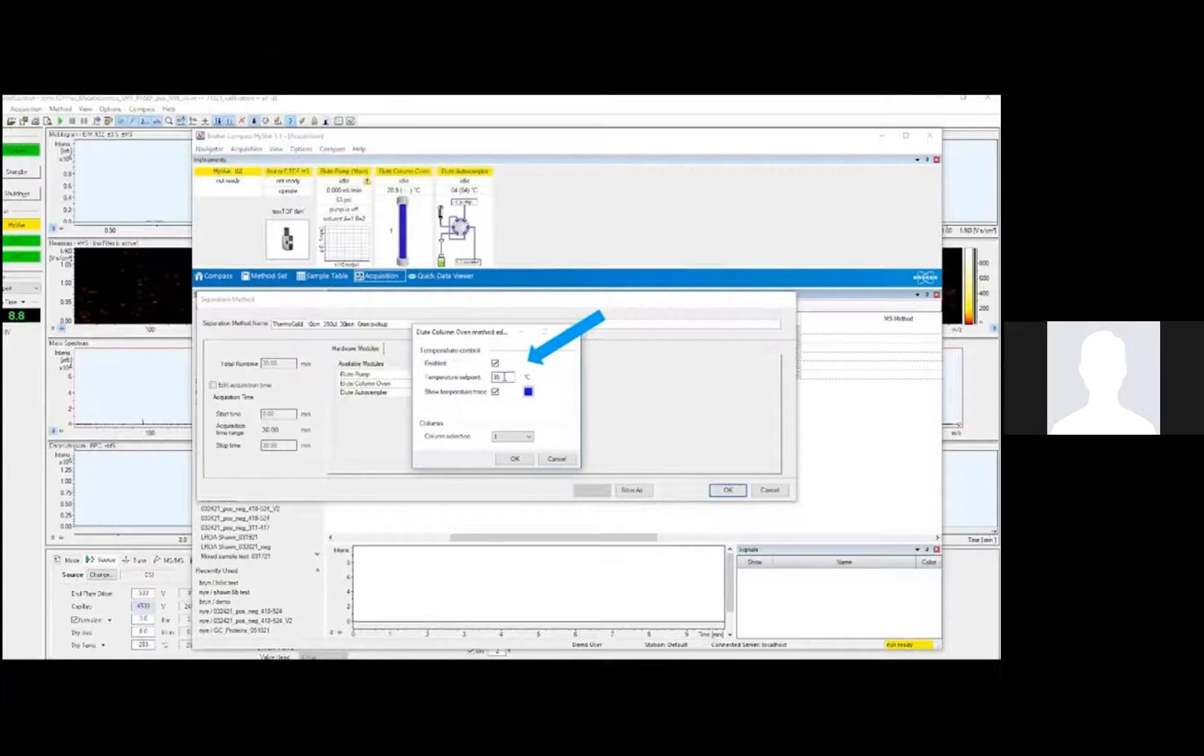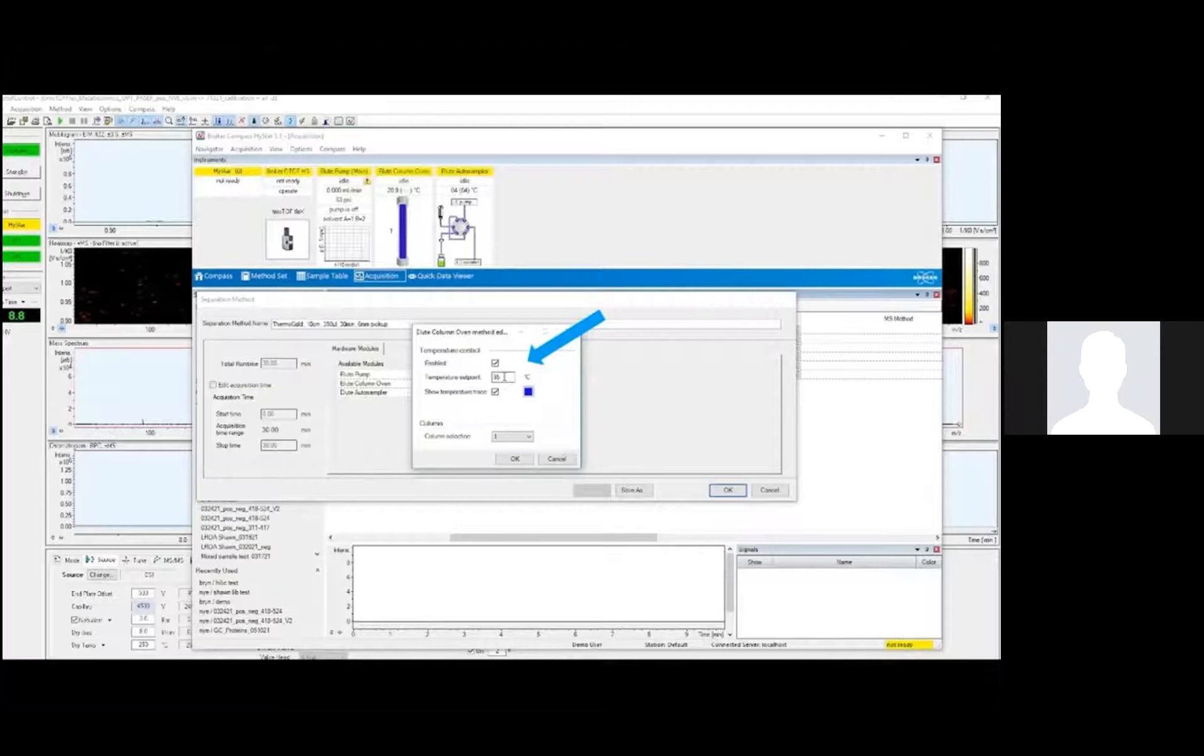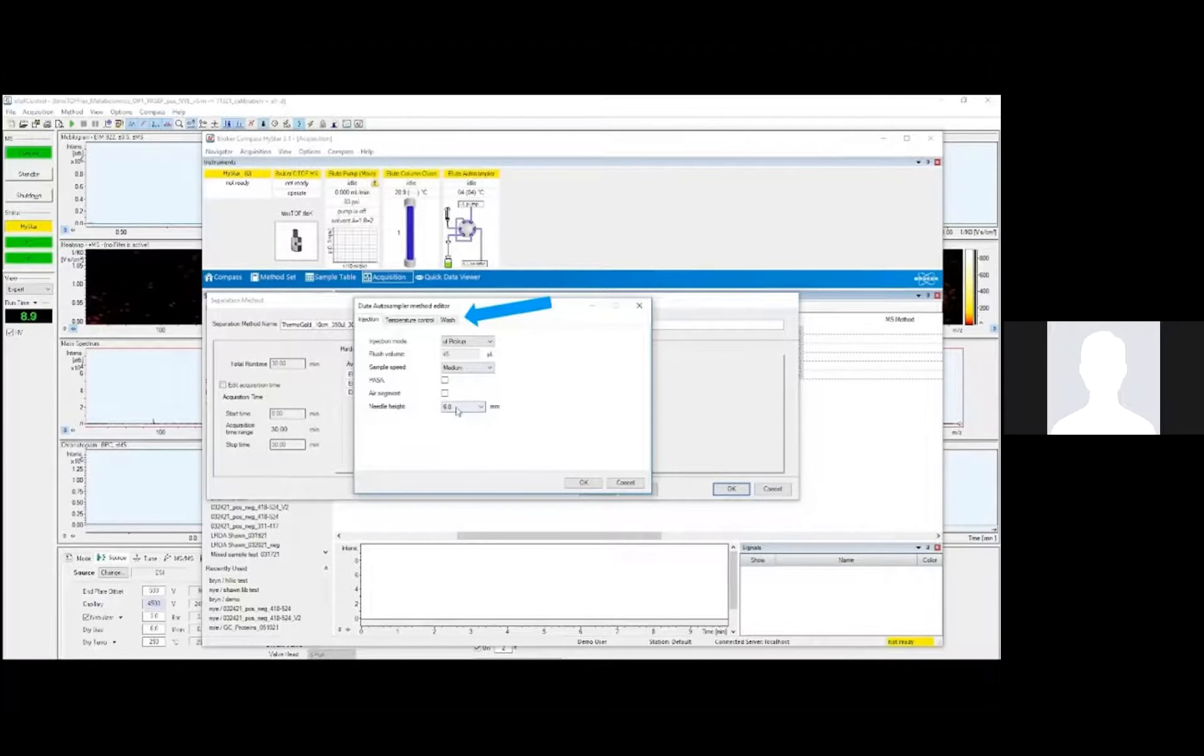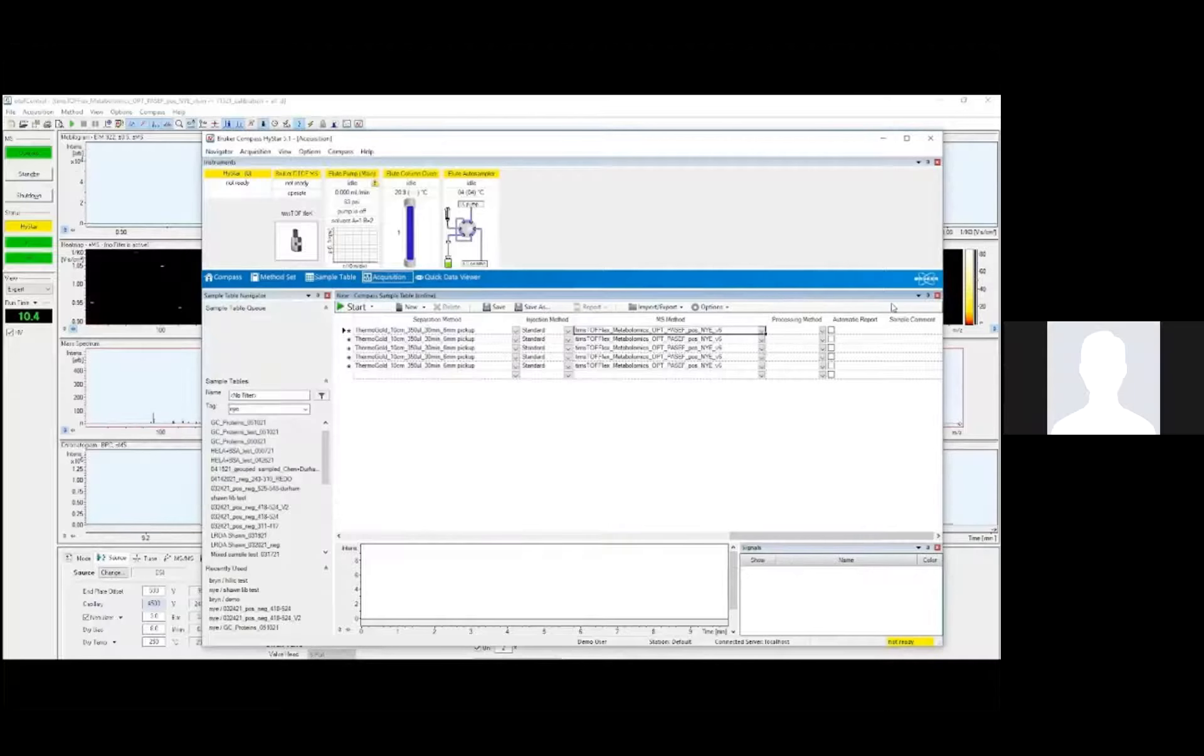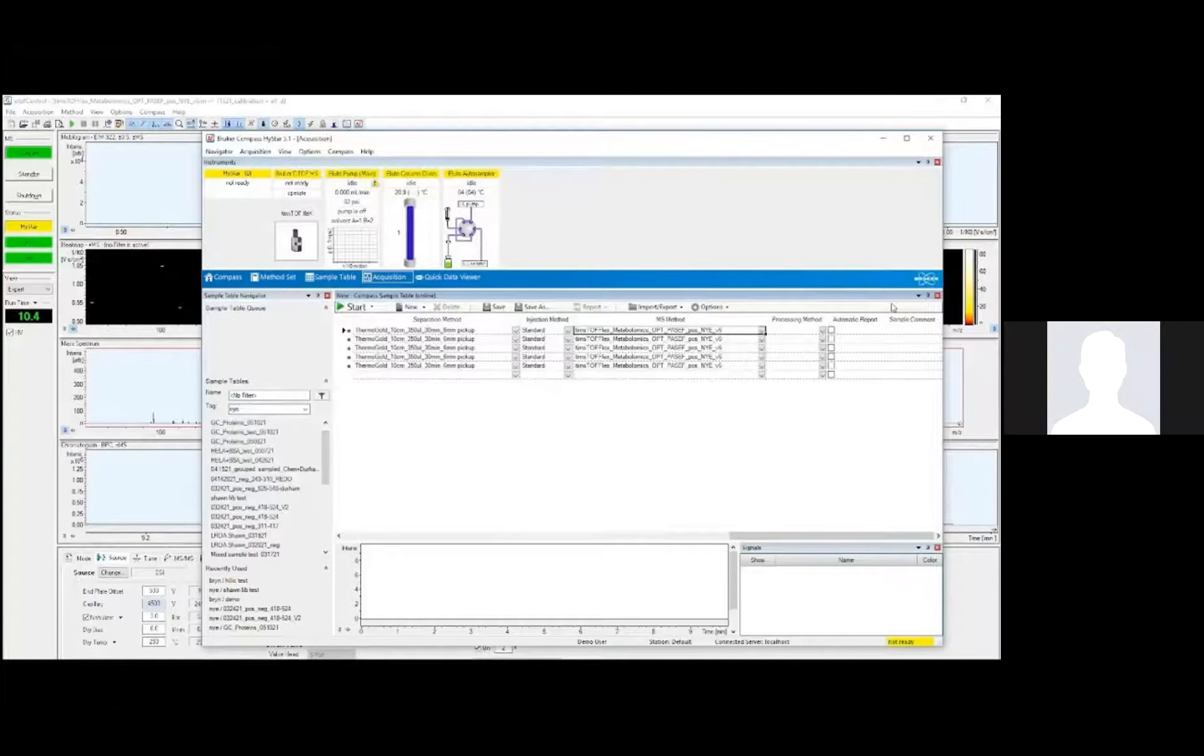Column oven control lets us set a temperature in the column chamber. This temperature control can help maintain consistency between sample runs. Importantly, we also need to check column selection here to ensure that the LC is pushing solvent through the correct port and column. We can also change the auto-sampler settings to set injection mode, needle height, temperature the samples are retained at, and how many times the auto-sampler needle is washed per injection. So I'm now happy with the separation method, and I just need to select the right mass spectrometry method. And that'll be the one I just showed you a few minutes ago. None of the other columns in the sample table here are really relevant for today.